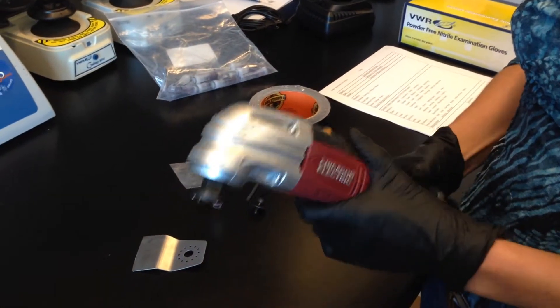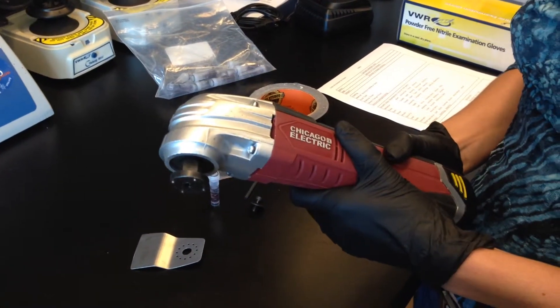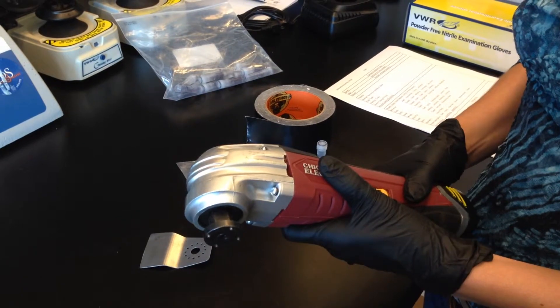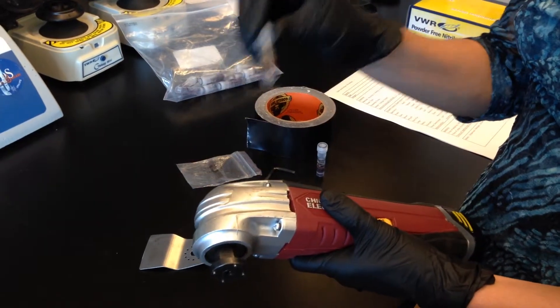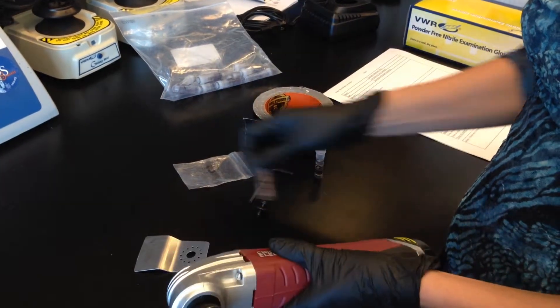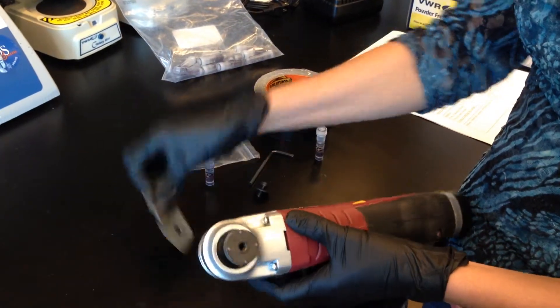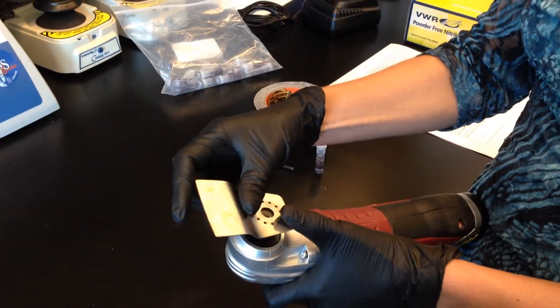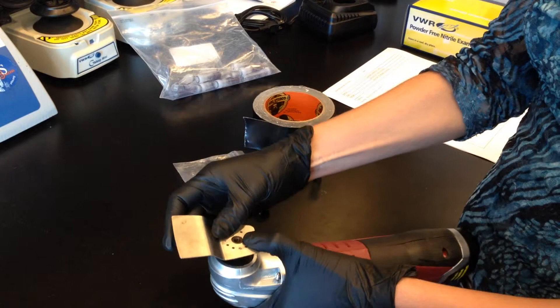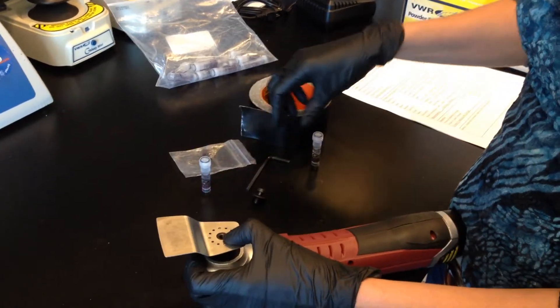I'm going to show you how to use this handheld oscillatory tool to bead beat a MoBio Powerbead tube. First, you attach this metal scraper tool to the oscillatory tool.